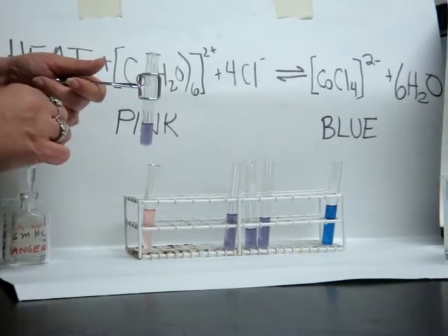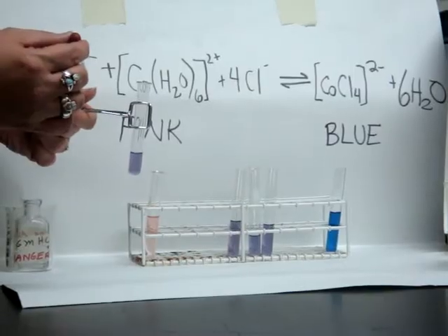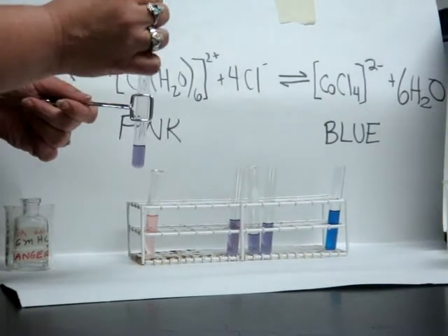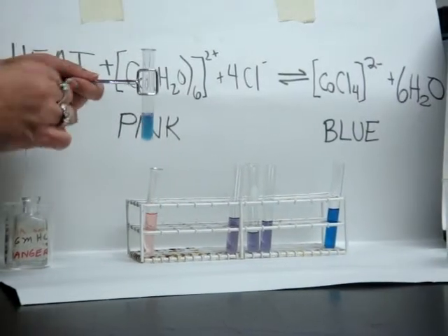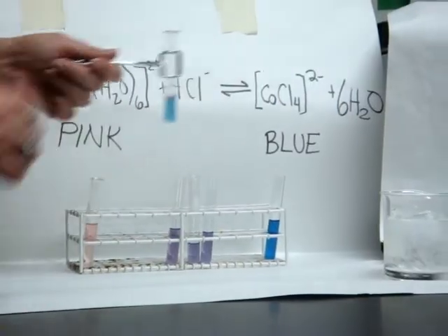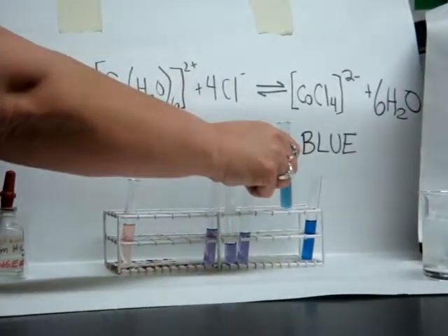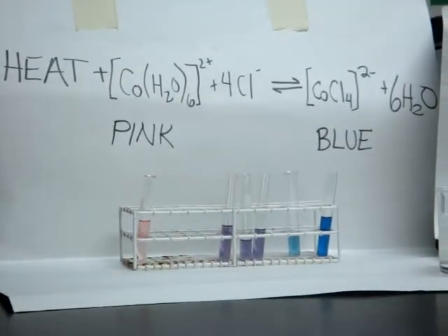I'm adding HCl. Which way do you think it's going to shift? All right, let's see if you're right. I'm going to add the acid and it shifted to the right. I'll put that on that side. So acid made it shift right.